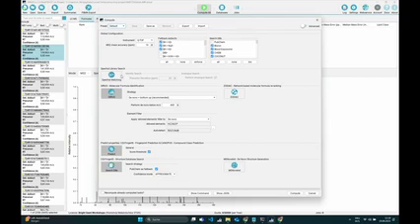The first button that you can enable is the spectral matching part, where we can look at spectra for validation against reference spectra. This, of course, only makes sense if you also have some spectral libraries selected. You can, for example, select the precursor deviation that is allowed. Also, you can toggle the analog search on and off.